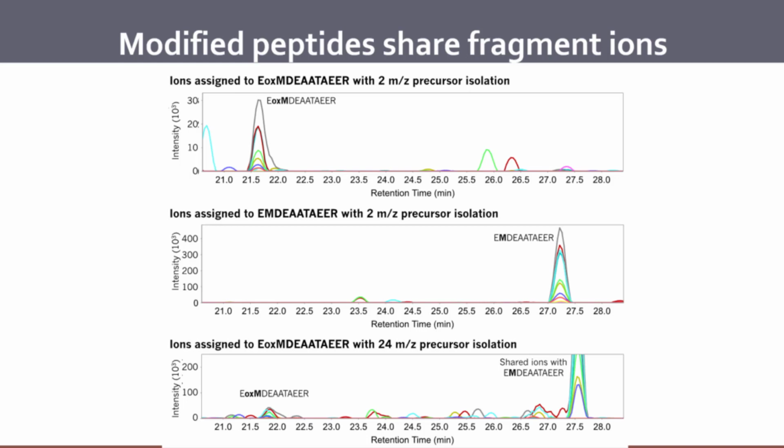So I think the way we're trying to advocate here is that you start with collecting narrow window DIA data, with 2 m/z wide windows, but the only things that will really get through are deamidation and citrullination, right? Those are the two modifications that will get through. Citrullination, though, changes the cleavage site, so that can be derived differently too. But deamidation is the main thing that can get through.